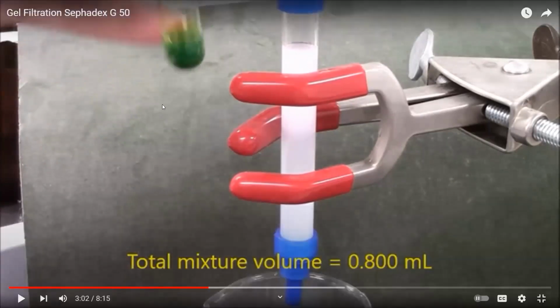So he has mixed those 2 components together. He has chosen those 2 components based on their size. Okay, you saw that there's a huge difference between the molecular masses. And before he is loading the column, he has removed the buffer, because you do not want to really dilute it too much. So just before you load your sample, there shouldn't be excess buffer on the gel bed.